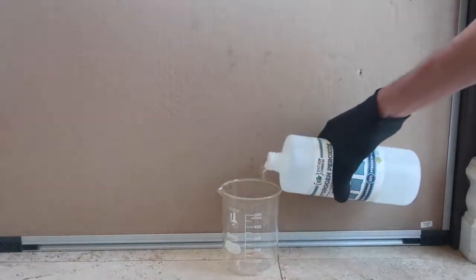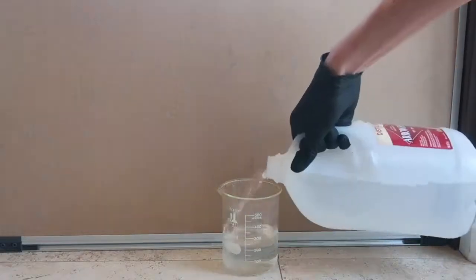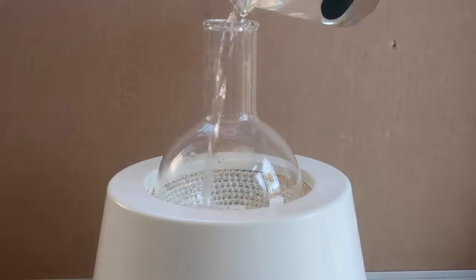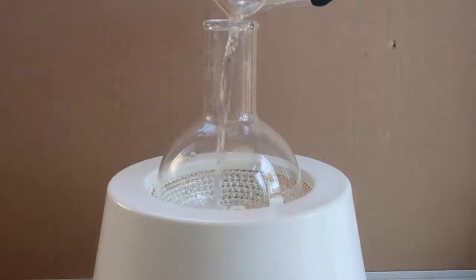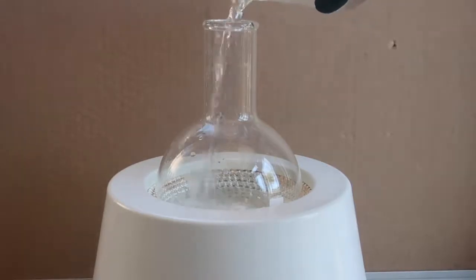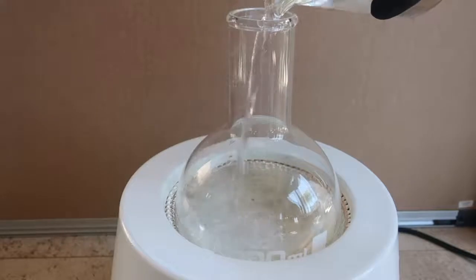And finally, for the third solution, I mixed 200 milliliters of 30% hydrogen peroxide and 300 milliliters of water. Now that I have all three solutions, I mixed together 200 milliliters of the first solution and 200 milliliters of the second solution and turned on the stirring. And finally, for the magical moment, I added 200 milliliters of the third solution.